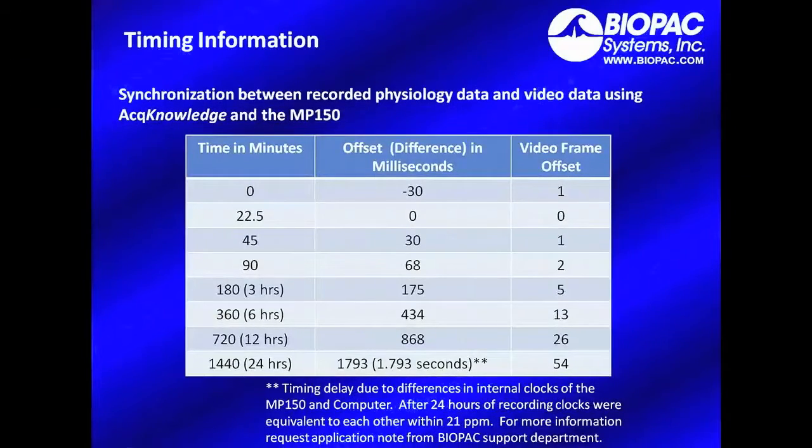Now that you've seen how to set up your system using an LED light as a reference, let's go over some important timing information. Synchronization between the recorded physiology data and the video data using AcqKnowledge and the MP150 is quite precise. Multiple tests were performed over varying times from 0 to 24 hours to take a look at the offset or difference between the physiology data and the video frames.